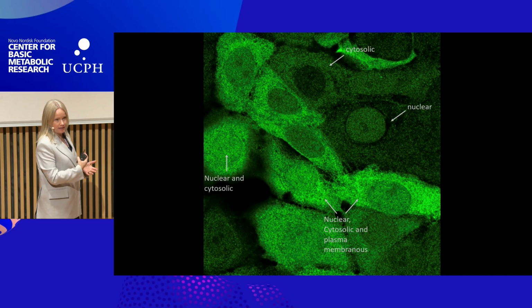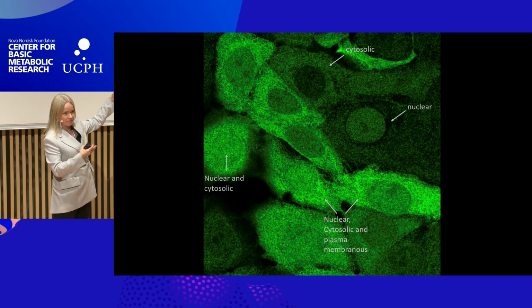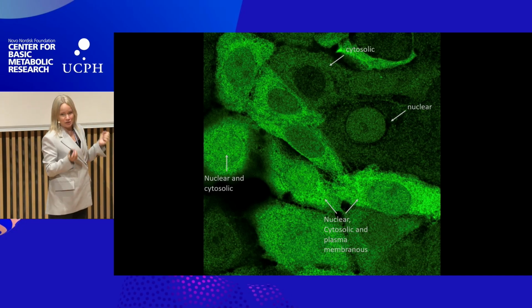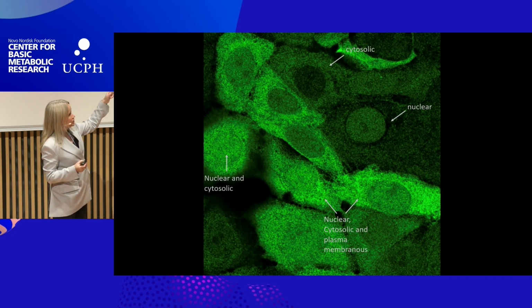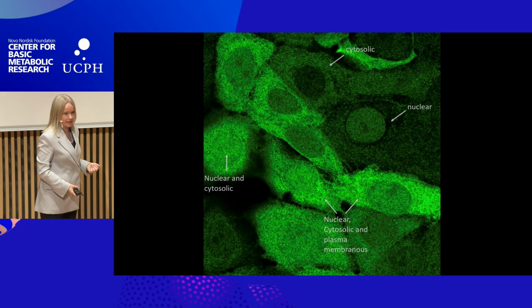It's binding DNA and regulating gene expression in the nucleus, and it functions as a plasminogen receptor on the cell surface. So I think it's quite fascinating to think about that these cells that are more or less identical show very different functional capacities when you look at just the localization of enolase 1 alone and the expression level, the brightness here.